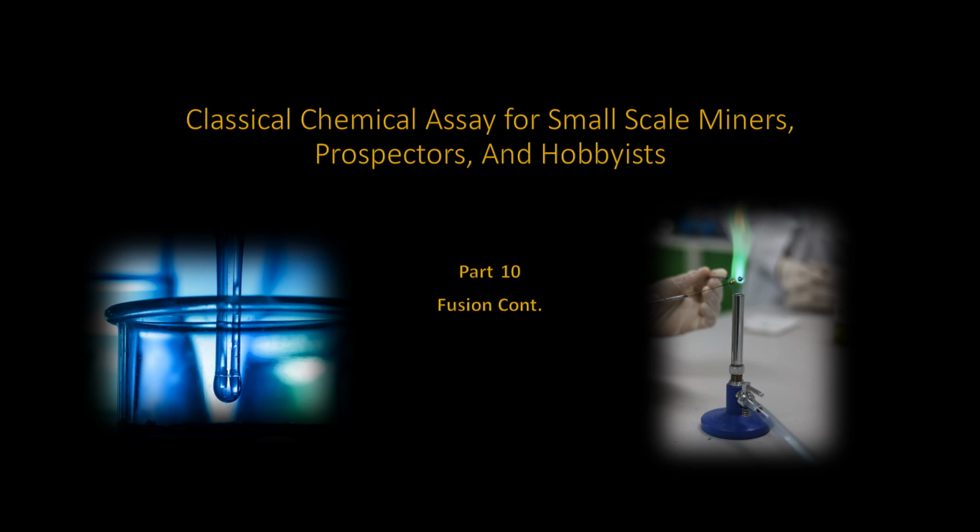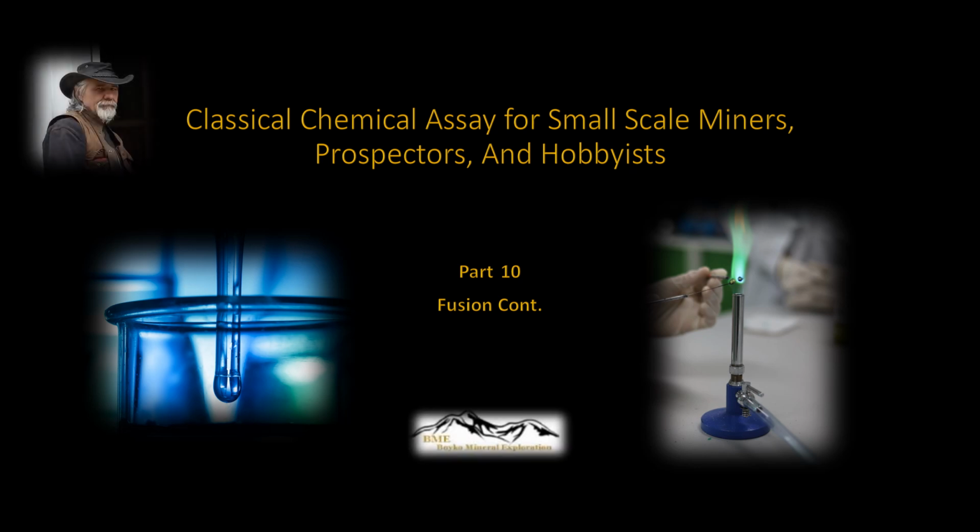In part 9, I started the discussion on fusion. I talked about some of the crucibles used as well as some of the flux material employed. In this presentation, I would like to elaborate a little bit more on the use of flux and also on the crucibles that are sometimes used in the effort of totally dissolving samples. I am Rob Boyko, Boyko Mineral Exploration, and welcome back.